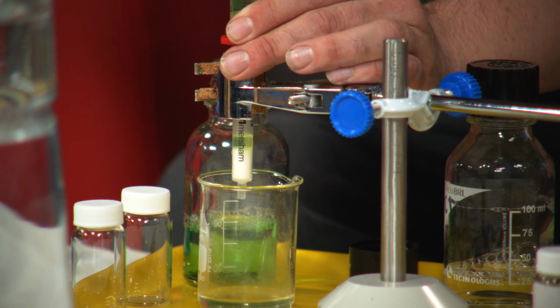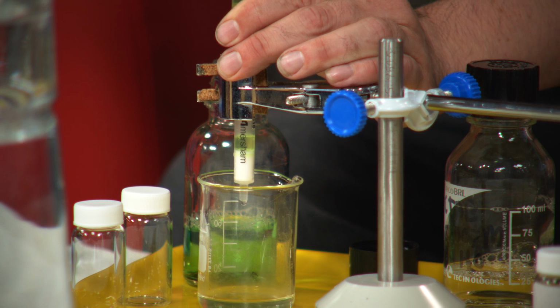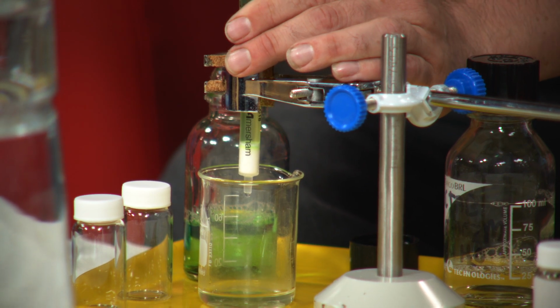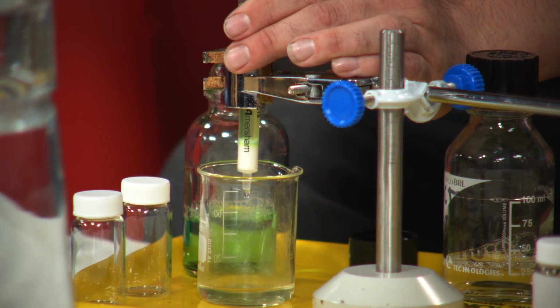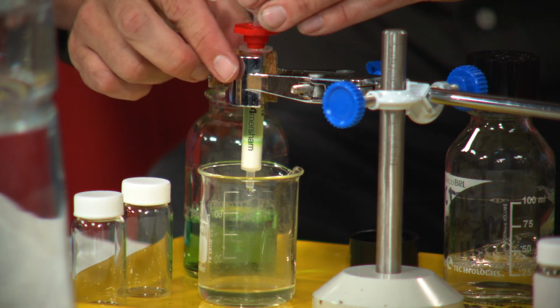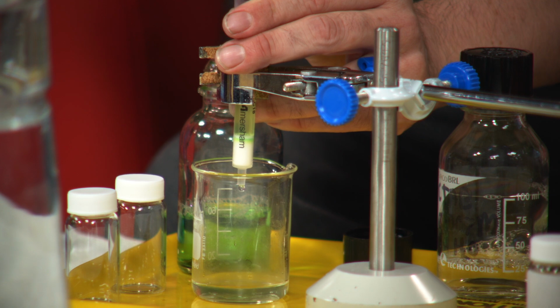Again, do this as slowly or as quickly as you wish, but slow is good sometimes. Try and break the airlock. And then remove it, and then push it onto the column material. Oops.